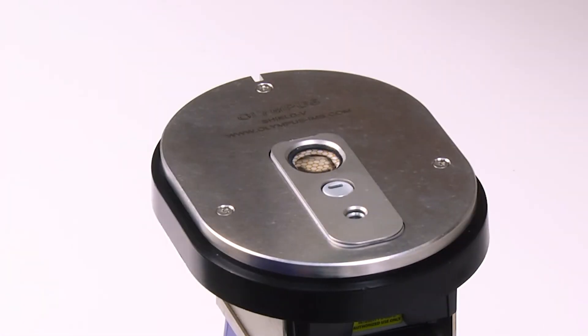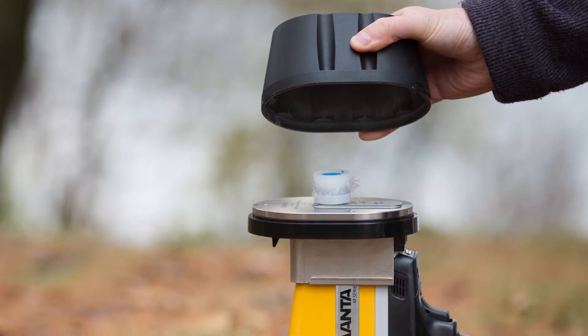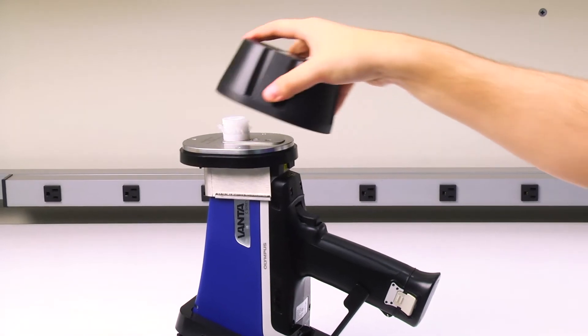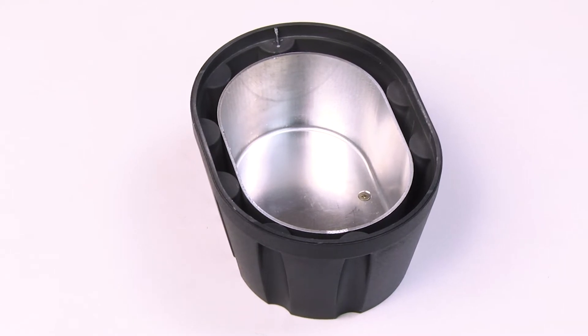Next, place the sample over the sample window. Finally, take the shield cover and secure it over the sample, making sure that the Olympus logo is lined up with the top of the Vanta. This cover is made of tungsten-infused plastic with an aluminum interior, protecting you from any stray x-rays that may occur during testing.